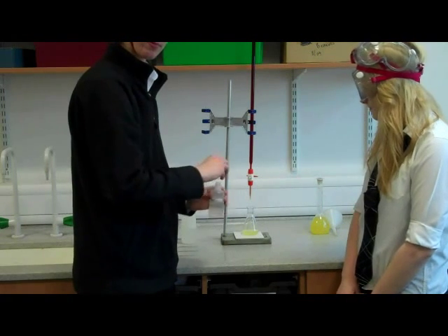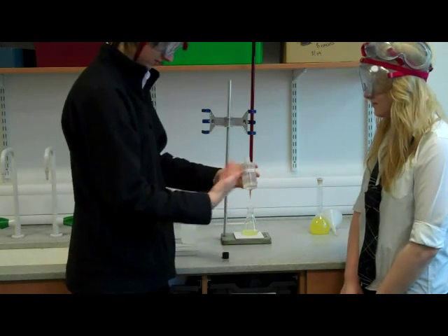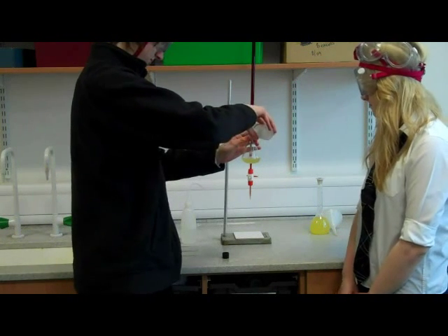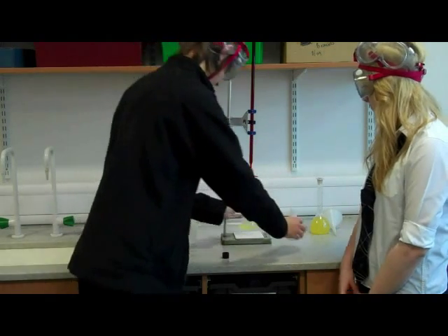Step 6. Using starch solution as an indicator, begin to drain iodine solution out of the burette into a conical flask until the solution stays black.